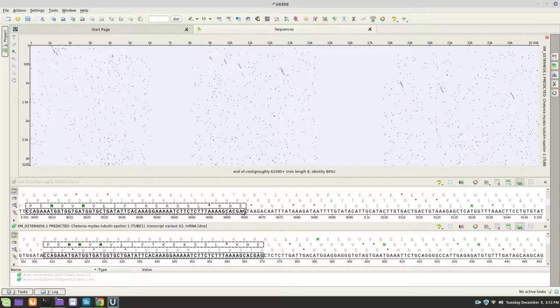If you want to go ahead and tell me the sequence that comes up in between your splice sites, that's great. Not requiring it, that's a little extra work and we're limited on time, but at least come up with reasonable places you think it's spliced, and it's going to be, you know, in this area. You know, it might be a little further down, but generally find the handout and find the reasonable splice sites and say, oh, here's one, and then there's going to be one on the other. So go through and identify these just like this.